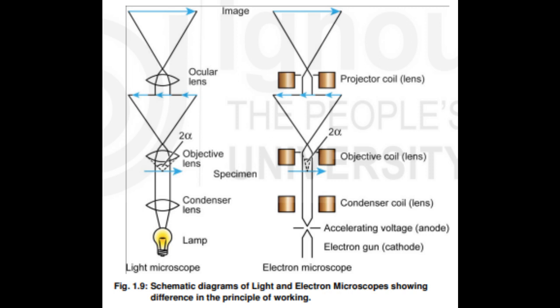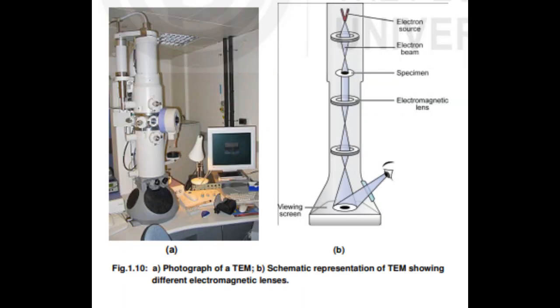The photographic film or plate is exposed directly to the electron beam, or a fiber optic light guide is used to the sensor of a CCD camera. The image detected by the CCD may be visualized on a monitor or computer.